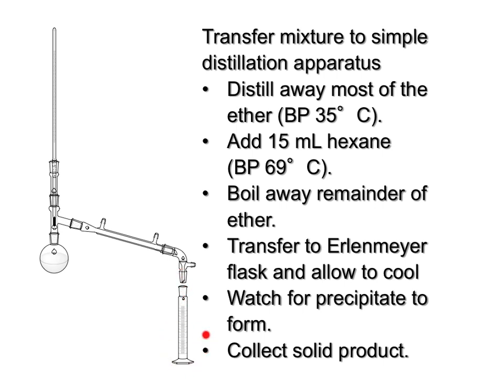Put it in an ice bath, because if we're distilling away ether, it has a fairly low boiling point, and so we want to be able to keep it in our receiving flask. Okay, our receiving container. So putting this in an ice bath will help. Okay.